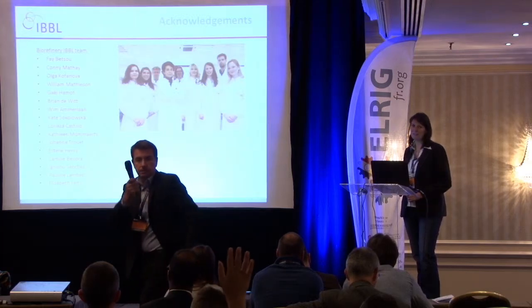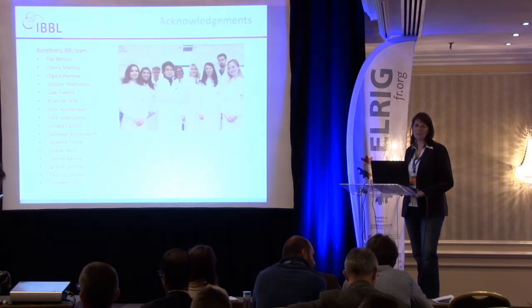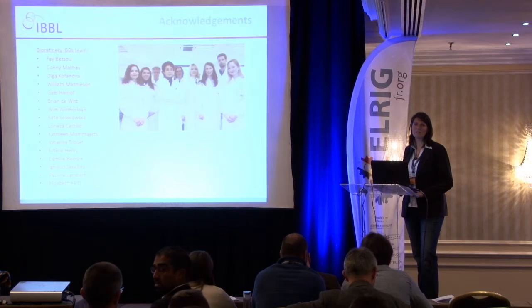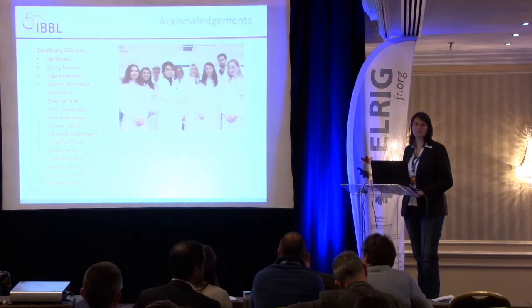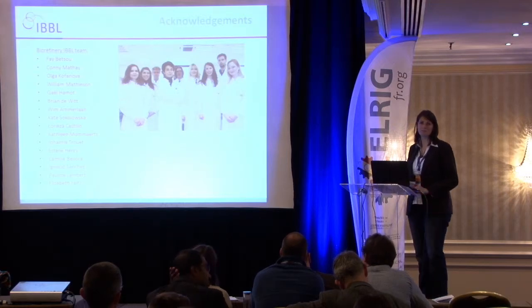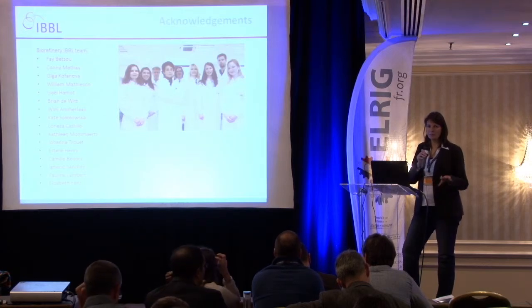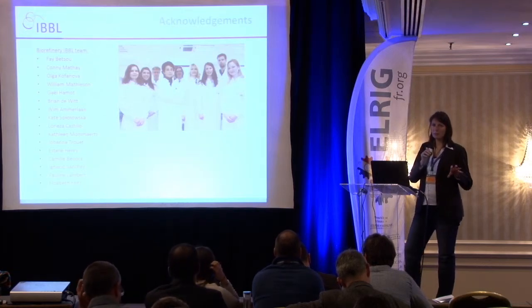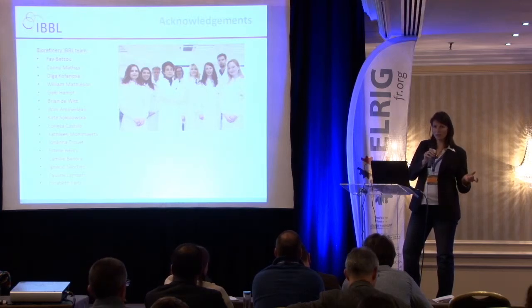Other questions? I was wondering, how do you validate an automated method? Do you just do a bridging between the manual and automated method, or do you test several validation parameters? For the method validation, a main part is really to compare, as you said, the manual against the automated part.